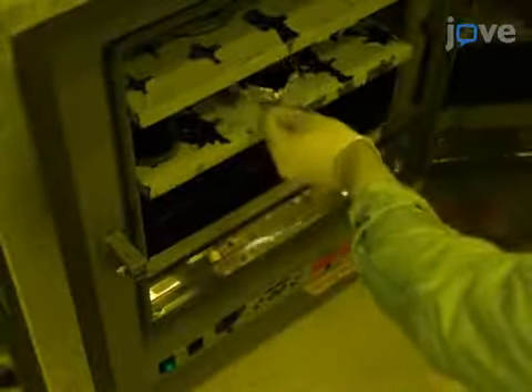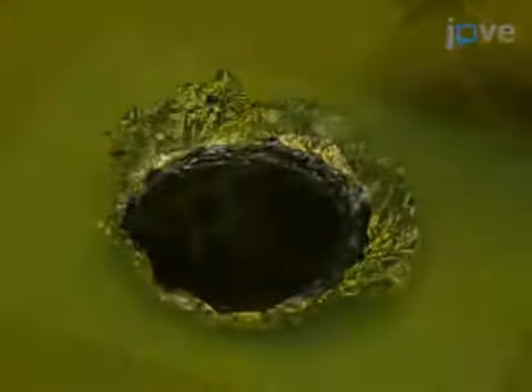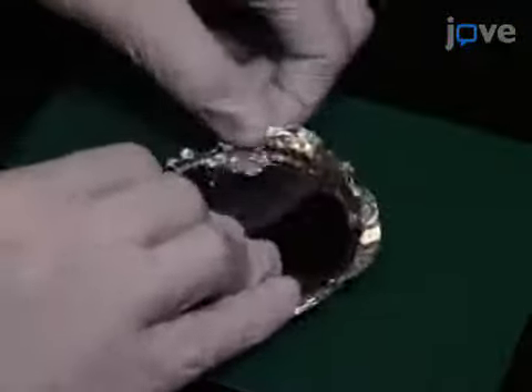Cure the PDMS in an oven at 60 degrees Celsius for at least one hour and cool it to room temperature. Then remove the aluminum foil containing the master and cured PDMS from the plate.